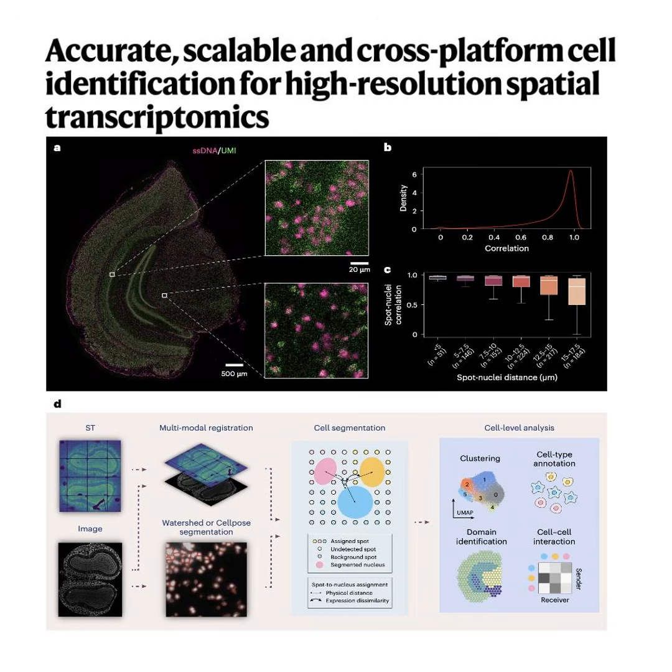Let's do another quick recap. Cellist uses NAP nucleus identification, alignment of the data layers, and probabilistic assignment. Balancing distance and RNA similarity smoothed out over a 2.5 micrometer radius. Exactly. So here's a question for you listening. If you were designing this algorithm, how much weight would you give to physical distance versus genetic similarity? Like, which do you naturally trust more in a messy biological environment? That's the billion-dollar question with the alpha parameter.